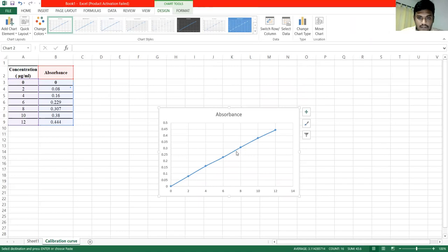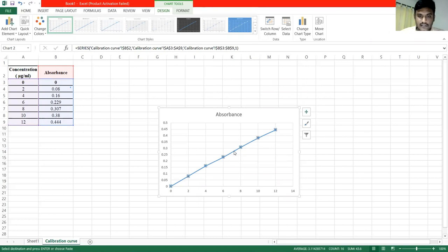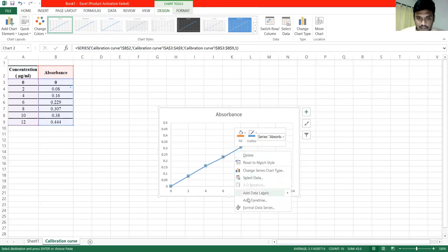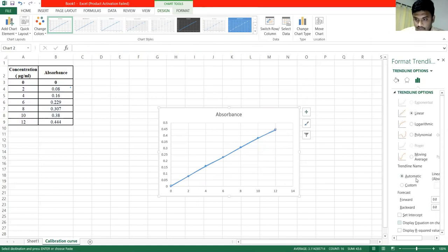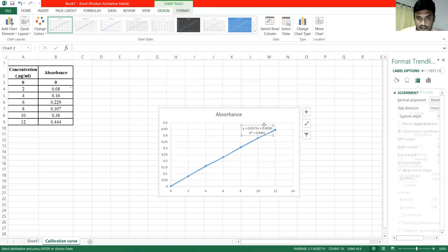If you have an R² value, click on the right button. You will open a small window. You will click on the right button to add a trendline. And if you have a different example, follow the same steps.